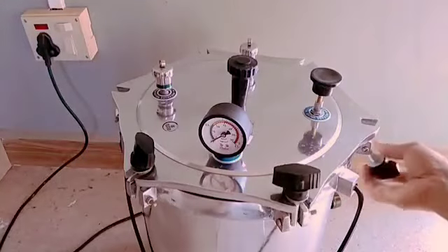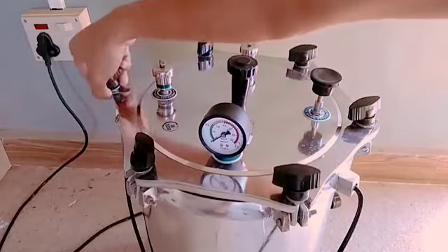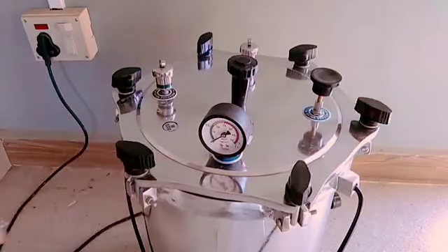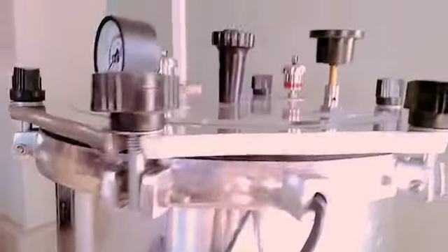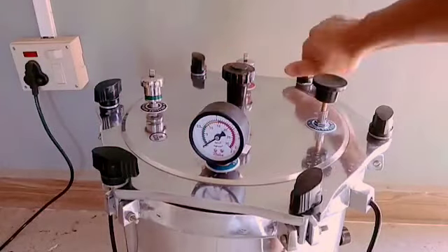A good practice for securing the lid tight is to first lift all the screws to their upright positions and then partially tighten each of the screws. Once all the screws have been partially tightened, make final checks, especially to see that the autoclave mouth is securely sealed all around by the rubber gasket of the lid. Now fully tighten the lid screws and the autoclave lid is now secured.